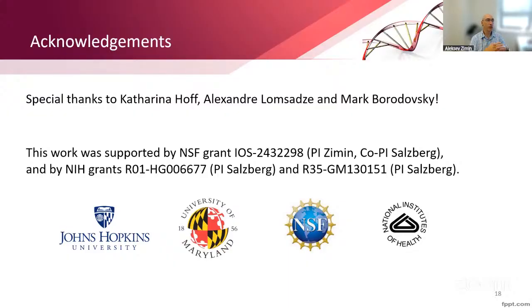Now, in terms of long and short RNA-seq, up until recently, I've been recommending getting Illumina RNA-seq data because it was the most cost-effective and it had the least amount of problems in producing transcripts.